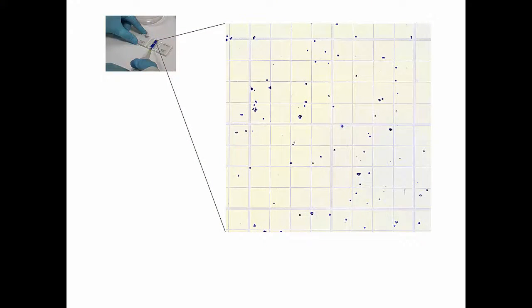Place the chamber on the microscope stage and focus the cells. The square pattern of the counting grid differs depending on the chamber type. The Fuchs-Rosenthal counting chamber you can see here has a pattern of 16 areas of 1 mm², each bordered by triple lines.